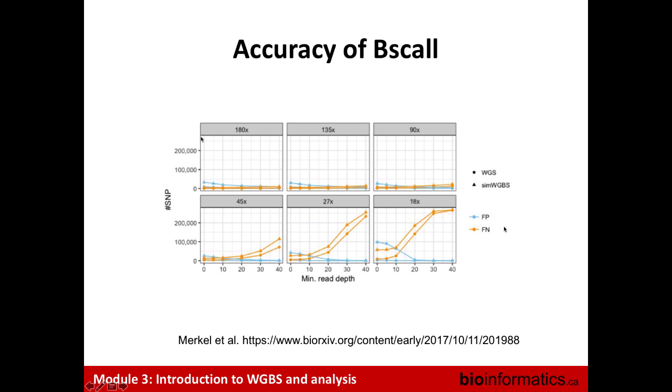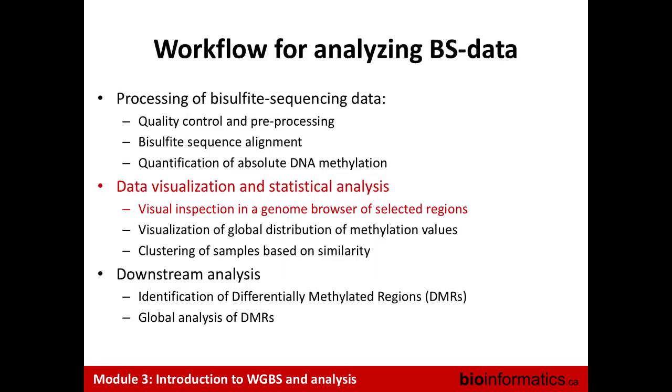mistakes, miscalls. One thing that would be interesting, which we don't have here, is a comparison with whole genome sequencing. Whole genome sequencing is much more robust at calling SNPs, but this also works reasonably well. Again, this is more as a nice to have. We won't be doing that in the practical per se.